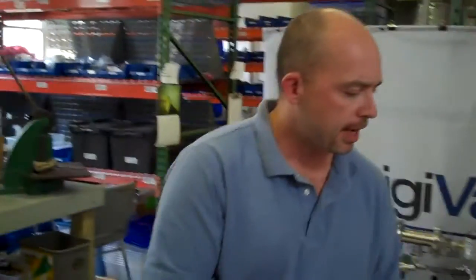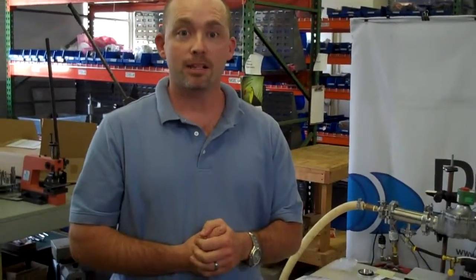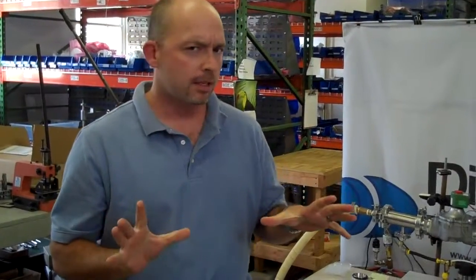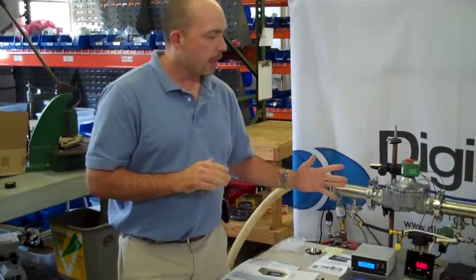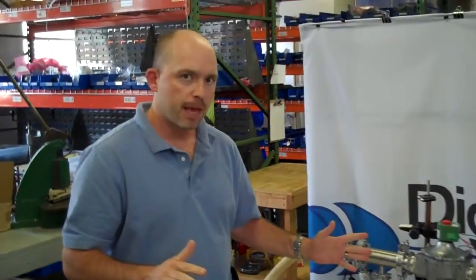What I'm here to tell you about today is not necessarily the base 450, but a neat solution we came out to meet a customer need. This customer wanted to be able to actually maintain a ramp rate of vacuum. They wanted to start off at about 760 torr, and at 167 torr per hour, they wanted to slowly evacuate that vessel, probably to not stir up the contents of the process to about one torr.